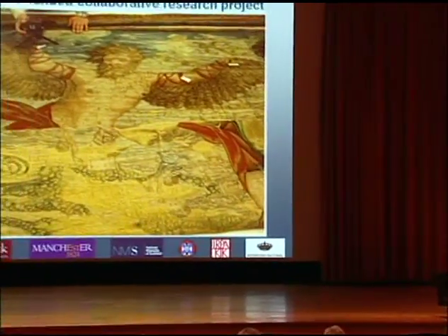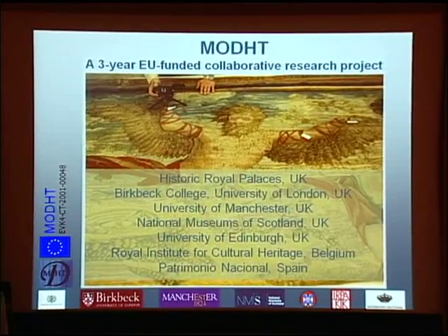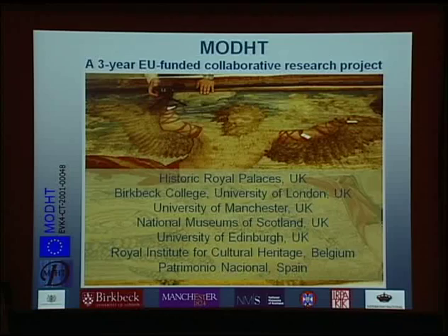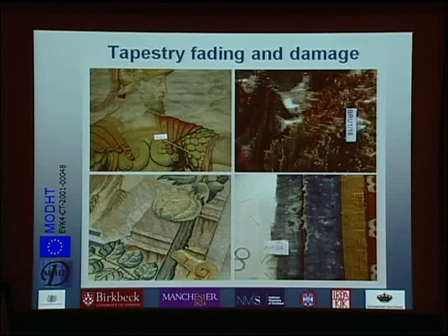Right, I'll be talking about the MODHT project, which stands for Monitoring of Damage in Historic Tapestries. I will specifically focus on one topic, which is the finding of microanalytical markers of damage. MODHT ran for 3 years, between 2002 and 2005. It's a collaborative research project between 7 partners from the European Union, most of them from the UK, one from Belgium, one from Spain. The project really focused on the chemical identification of markers of damage, or that's the topic of today.